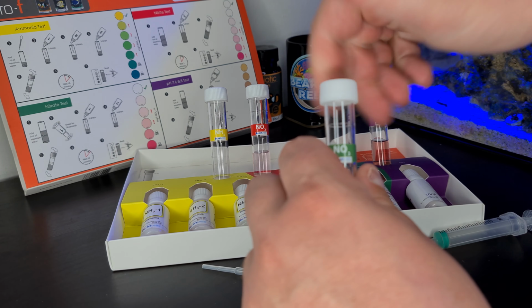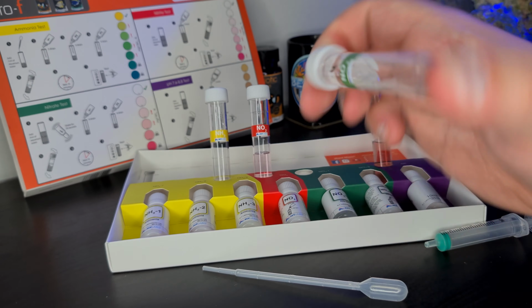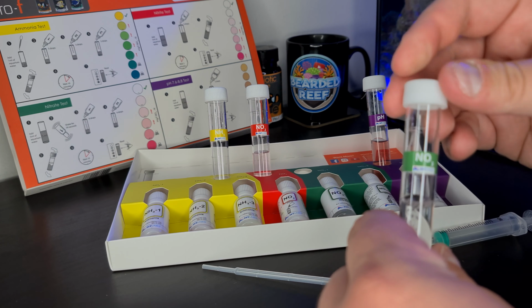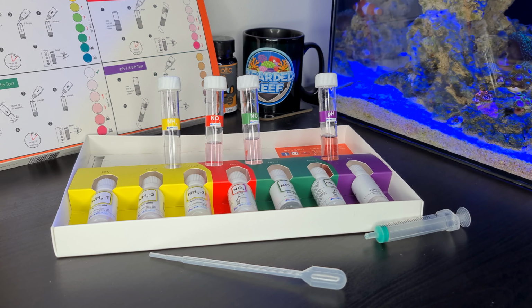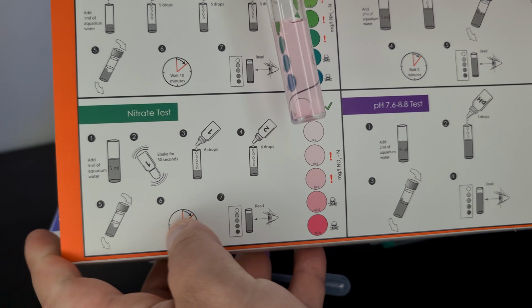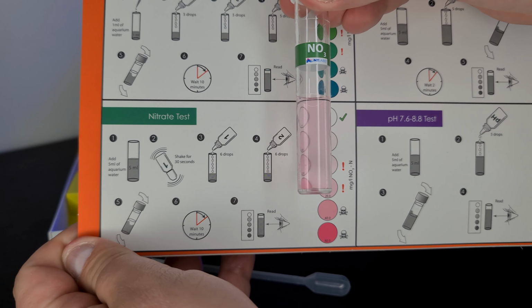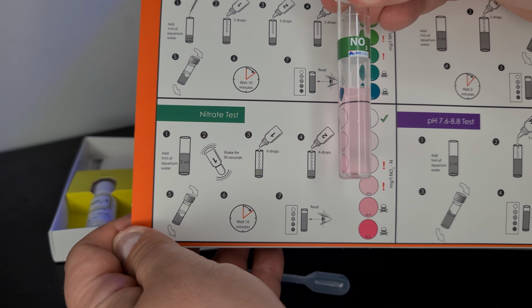You can see again, I'll skip that though, so you guys will have to sit for 10 minutes. Okay, so I'll sit that in there and I'll join you in 10 minutes time. Okay, so that's been 10 minutes up on the nitrate test now. As you can see, there's a slight bit of colour there, so bring the chart over and we'll have a look. Yeah, again, I don't know how these colours show on the camera, but for me, that's between, I would say, 5 and 10, which would be about right.